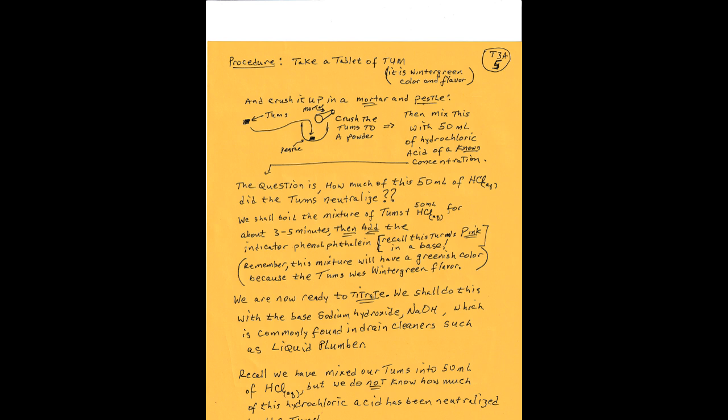So in the lab, we're going to take a tablet of Tums, and it's going to be wintergreen. Keep in mind it's wintergreen, so it's going to have a greenish hue, a greenish color, and flavor if you eat it. There's my Tums, my little dark thing. It's not a great picture. We're going to crush it up in a mortar and pestle, and some of you use this in cooking. We're going to crush this up into a powder.